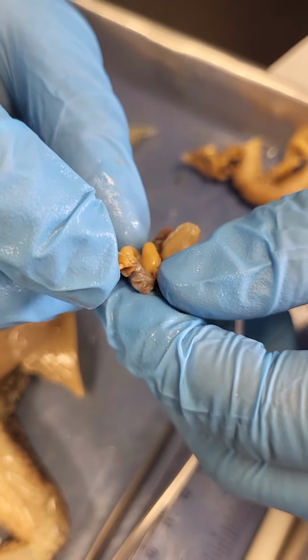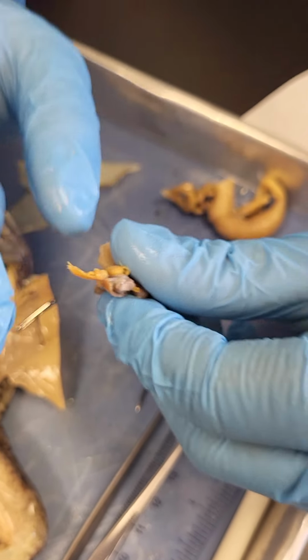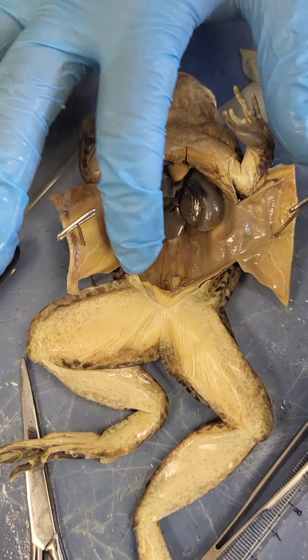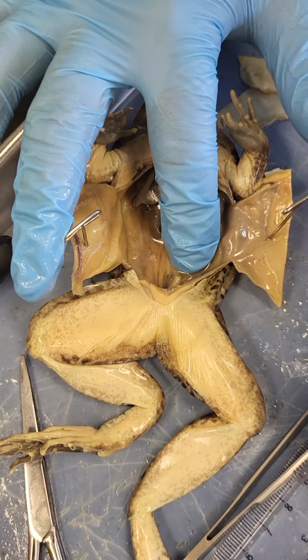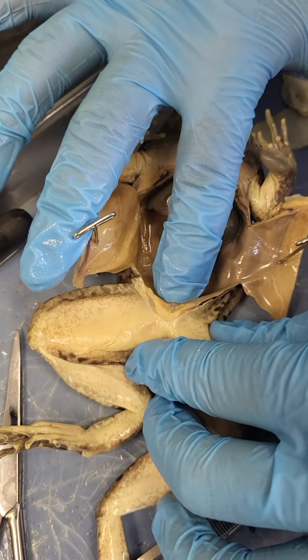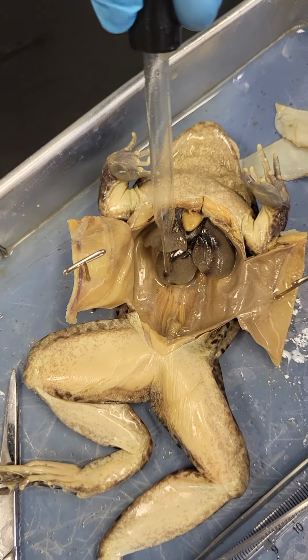My guess wasn't correct. I thought it was just bigger than normal. Look at him. Oh, God. Tiny balls. A bladder. It's the bottom part. There's a bladder at the bottom part. Tiny balls. Someone should really take the syringe and get all the frog juice. Frog sex. The cloaca, which should be the very bottom, pretty much.